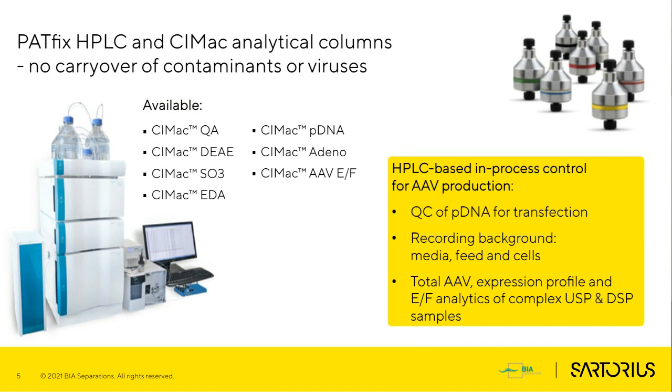Going back to our agenda. Today I'm going to present to you all the different ways in which you can use an HPLC system for analytical development throughout your whole bioprocess. We will mostly focus on upstream, as the group which I'm leading focuses on upstream process development to complement our downstream knowledge. So we will look a little bit at quality control of pDNA used for transfection.